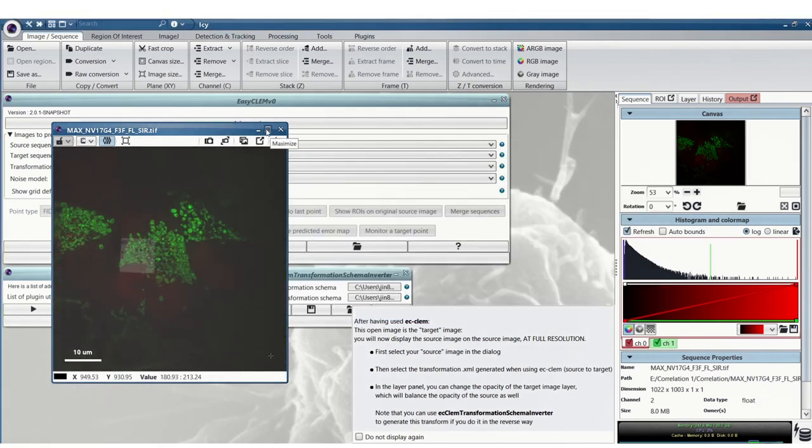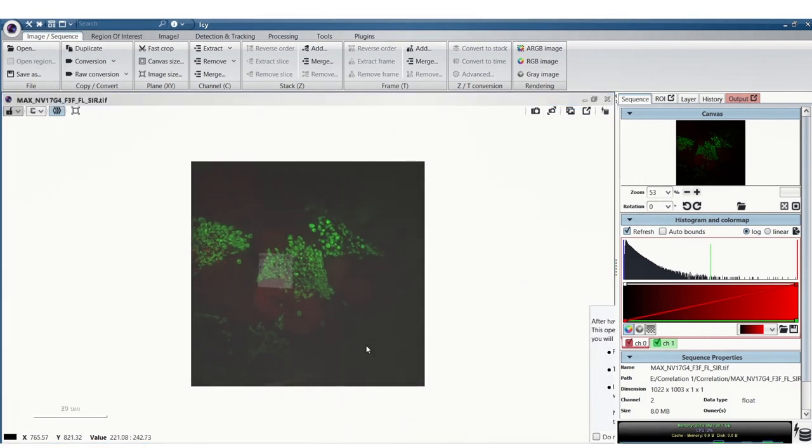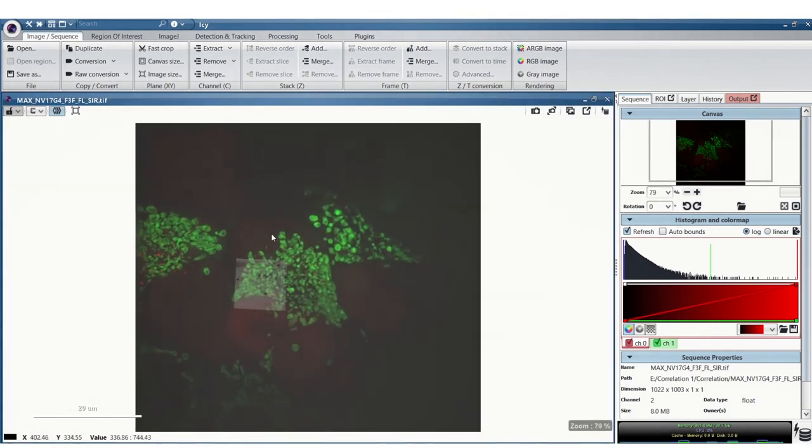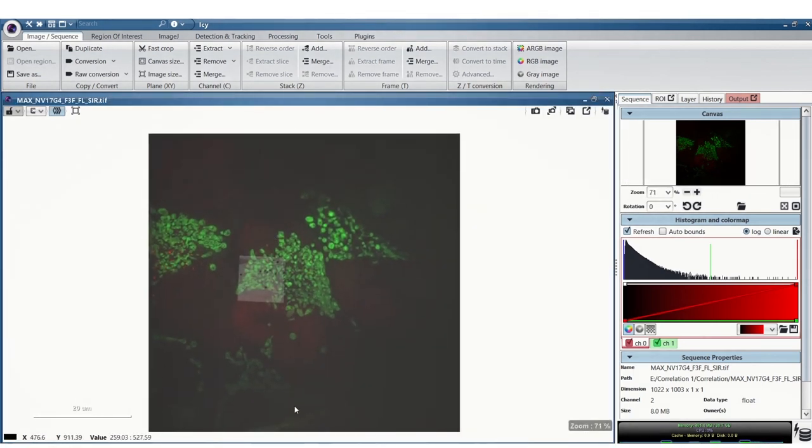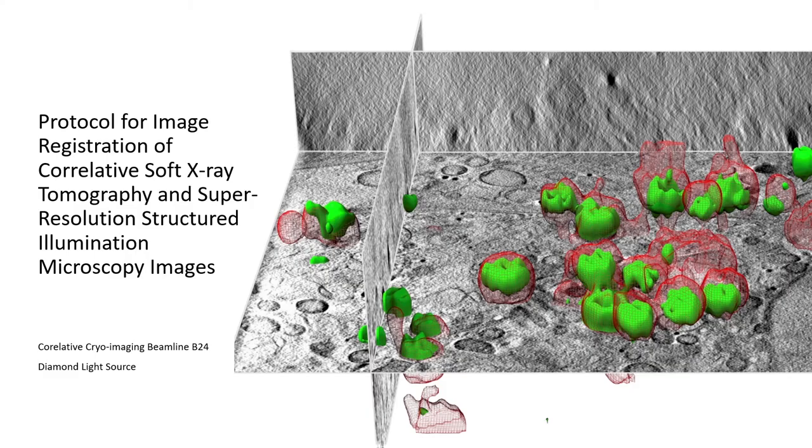Here you can see the overlay and at the moment you can save this by taking a screenshot but we are working on updating this. Perrine's working on updating this to work in 3D and as well as to save the images. So that's an overview of the correlation process for tomogram and sim images at B24.